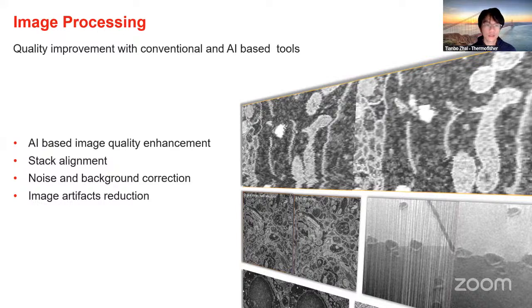That's usually one of the recommended first steps: to denoise and to correct some of the artifacts as much as you can upstream in the analysis workflow.